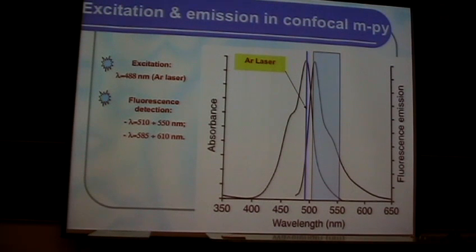And so, because of this spectral separation of absorption and fluorescence, one can excite the fluorescent dye using particular laser lines, such as argon laser at 488 nanometers, as shown in here, and then the fluorescent light can be detected at a longer wavelength, as shown in here, by blocking all the excitation light that might be still coming to the detection system due to reflections and other reasons, using the interference filters.